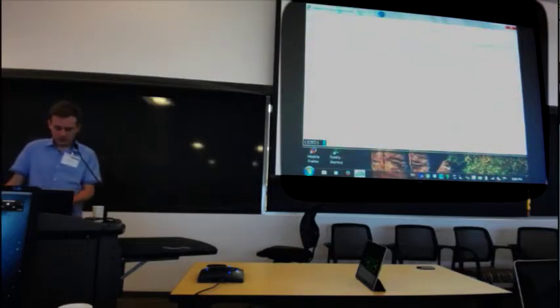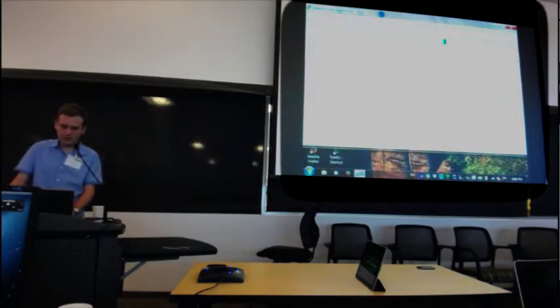The job is still running. So what is the output file? Where is it? Output file should be in CASS indexing ref jobs indexing out. He executed setup.sh, so he should have done it. Yeah, and you see that there are some images that are indexable.